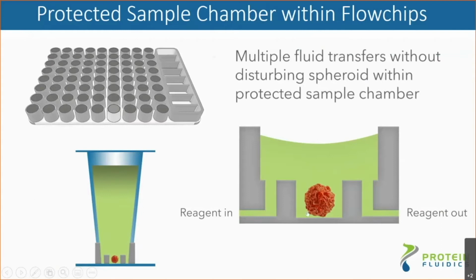Now, I should say that there's 7 ports that come in from the side. We also have a port that comes from the bottom. It's not shown here. So if you do need to drain all the fluid out of the well, you can do that. So if you're worried about any residual media or compound before a next step, you can drain the full well of the media or the compound.